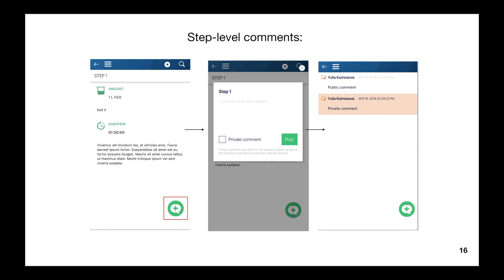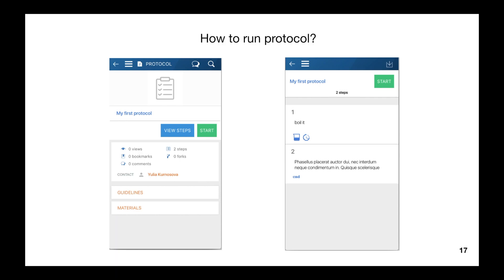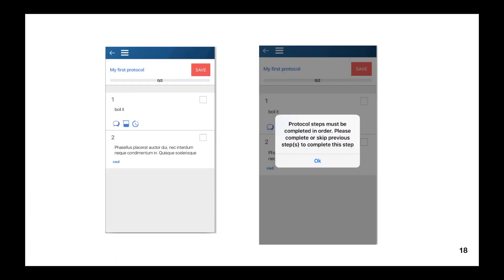Let's imagine you found the right protocol. You have two options to run it: from the protocol detail screen or via the step detail screen. The Run button changes to a Save button, and a progress bar appears at the top of the screen. A small square checkbox allows you to complete the step — just tap it. If you want to skip a step, swipe it from the right edge to the left edge.